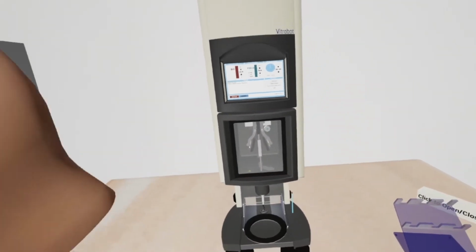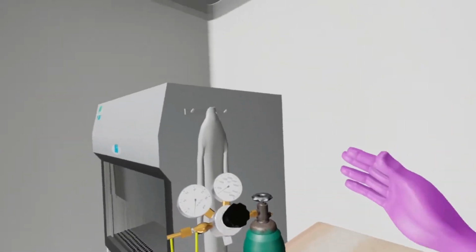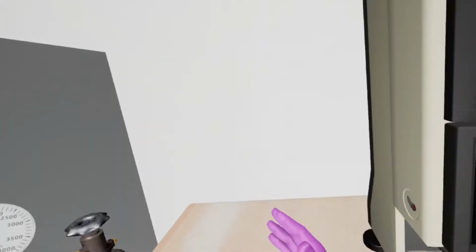Welcome to our Cryo VR training module. In this section you will learn about the operation of the Vitrobot. Let's begin.